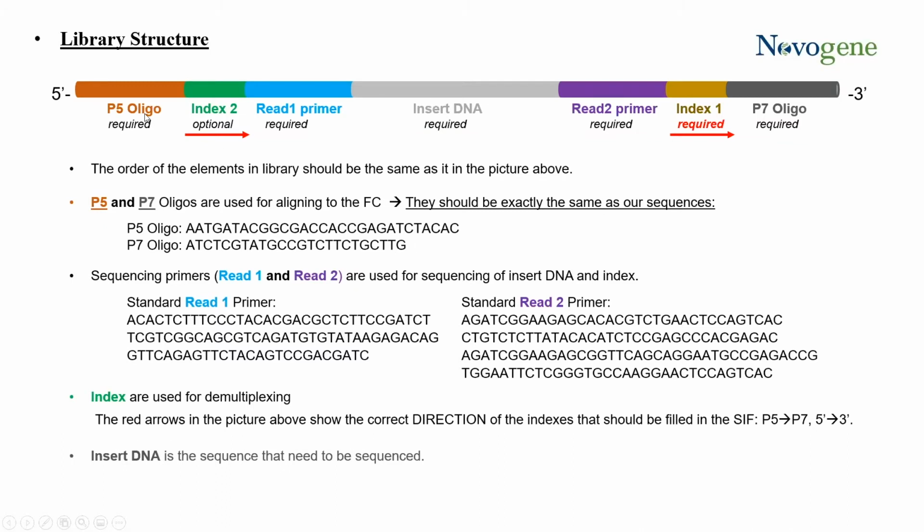So we've gone over the oligos, which are the P5, right? And so the oligos have to match exactly as what is Illumina available, right? So everything we do is run on Illumina chips. If the oligos do not match that, then there is no binding, there is no cluster generation, and no data produced. So we have to have exactly these sequences for us to get your data. But good news is that the vast majority of kits are Illumina compatible, and this shouldn't be a problem.